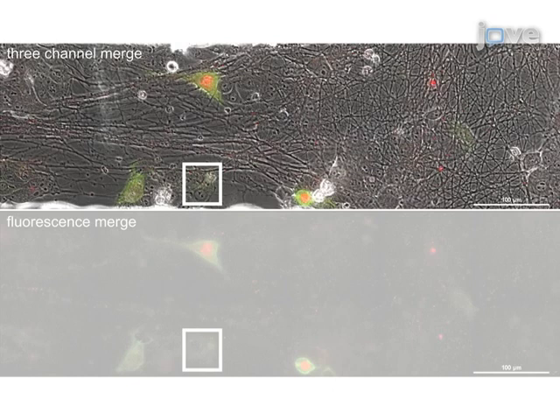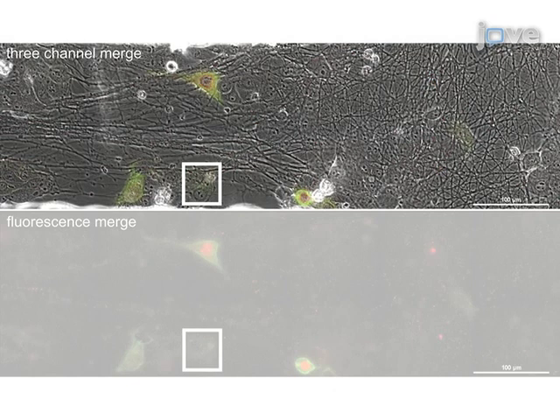In this first panel, a merged image of the transmitted YFP and RFP fluorescent images at a time post-infection when the recipient cells are beginning to express a membrane-bound YFP and VP26-MRFP fusion proteins are shown.